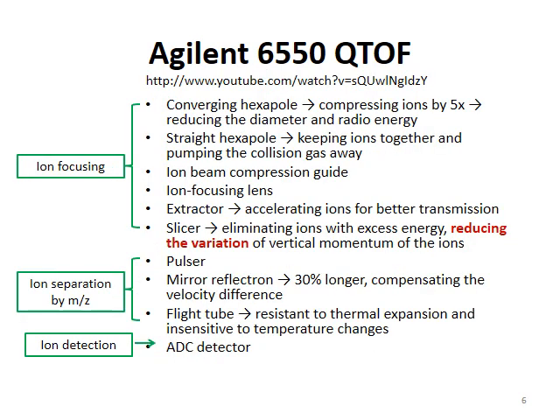Alright, moving on, followed by ion filtering and fragmentation. As you will see, ions must be prepared before they enter into TOF analyzer. So how have they been prepared before entering into the TOF analyzer?